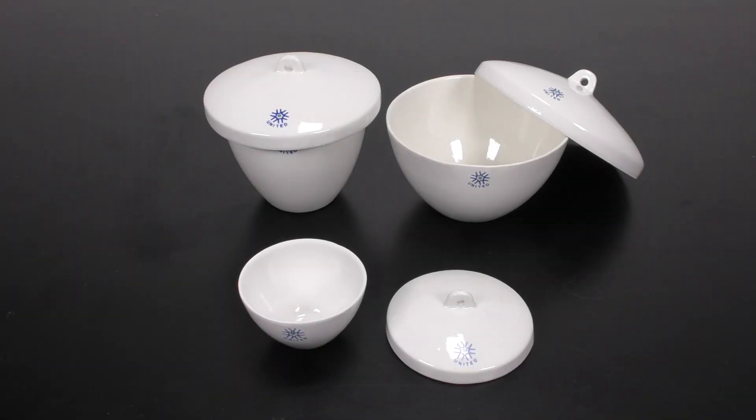A crucible is a vessel that is used to heat a sample up to very high temperatures. This can be because you want to speed up a reaction or you want to simply dry out a sample.